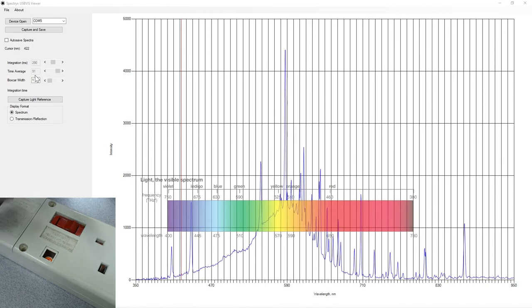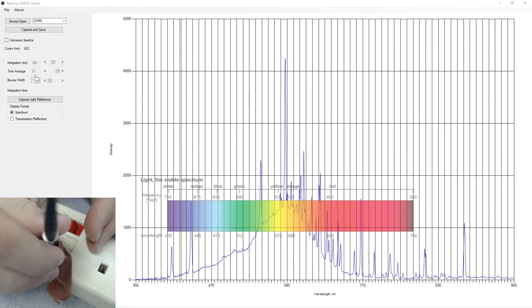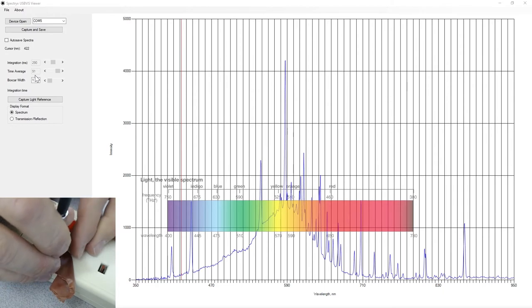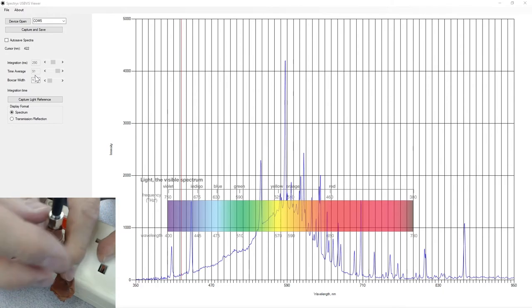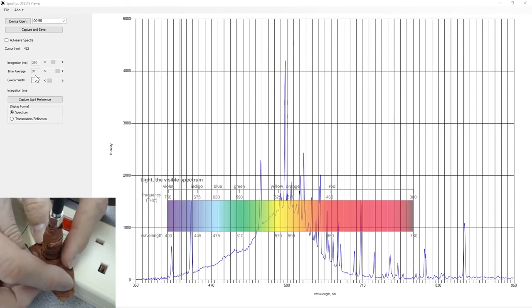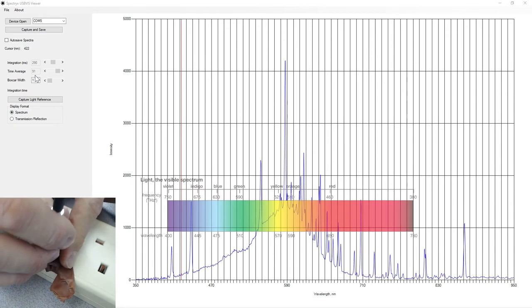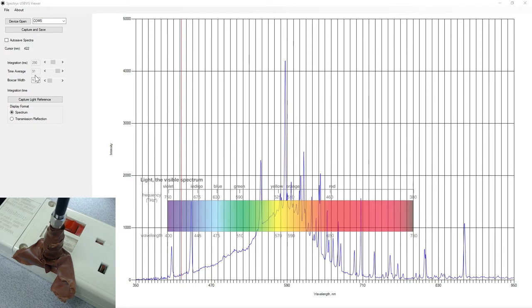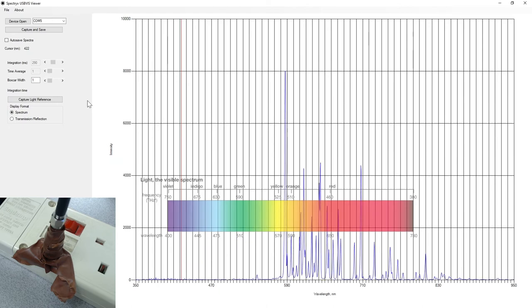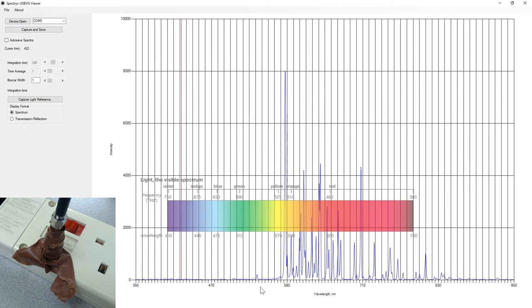If I go back and put this back into shot, it's only going to be seeing the neon, and the averaging will bring that down in time. Maybe if we change the average down here you'll see a much faster response. There we go, that's the live feedback. It's very satisfying because this device really does give you very fast responses. That's a 290 milliseconds integration time. Very clean signal coming from that neon light.